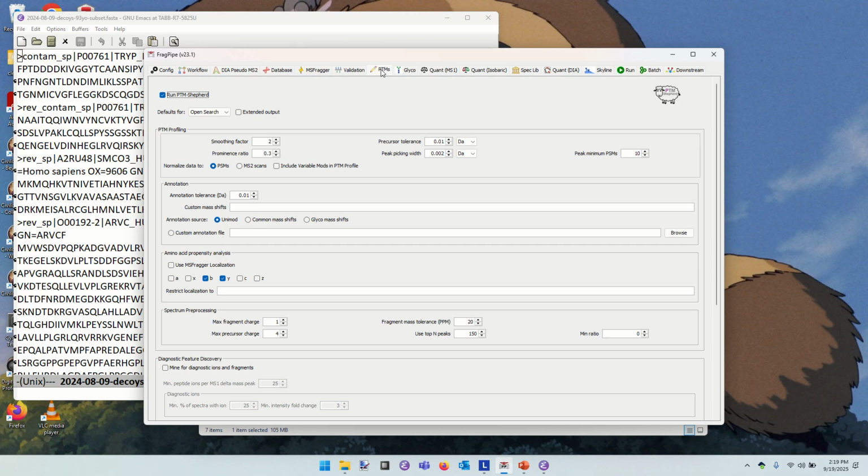Does everyone know what a semi-tryptic peptide is? Oh, okay, so to be careful about this, a semi-tryptic peptide states that one end of the peptide, maybe it's the N-terminus, maybe it's the C-terminus, one or the other is tryptic, but the other side doesn't conform to where trypsin should cut. So imagine that you had a signal peptide that got lopped off of the N-terminus of a protein, and that didn't end in R or K. Well, that first peptide would look like a semi-tryptic peptide because the N-terminus does not correspond to where trypsin would cut, but the C-terminus does.